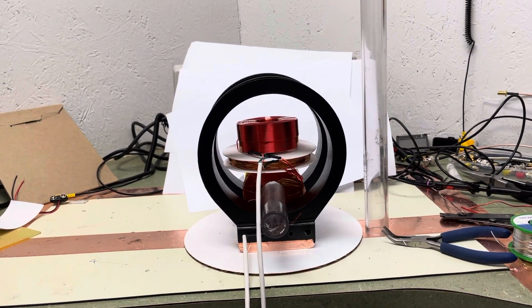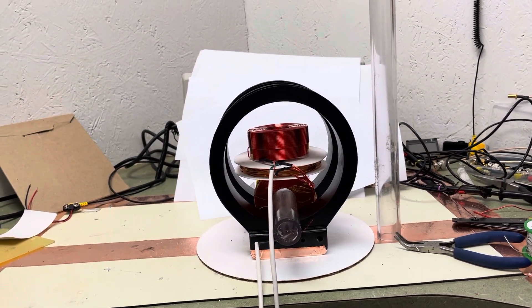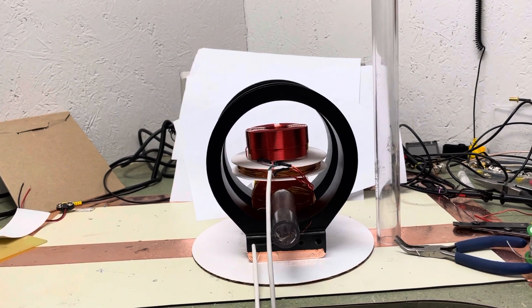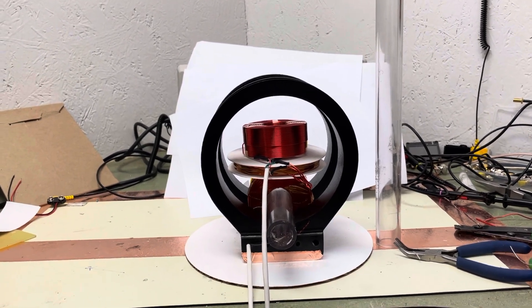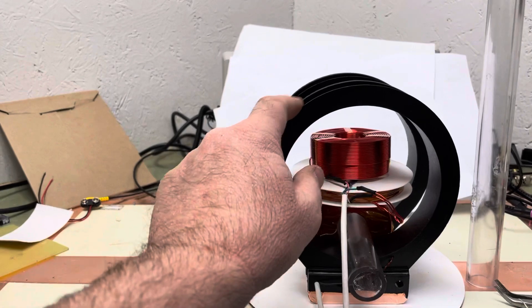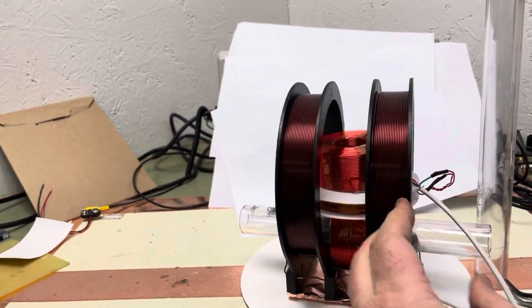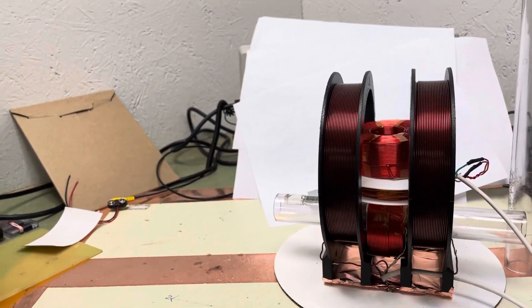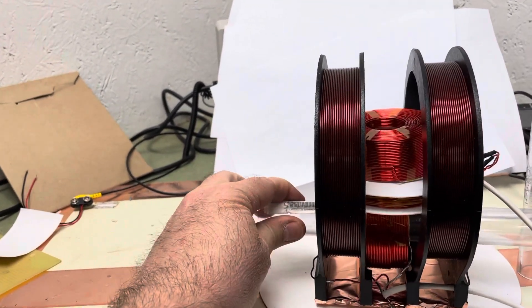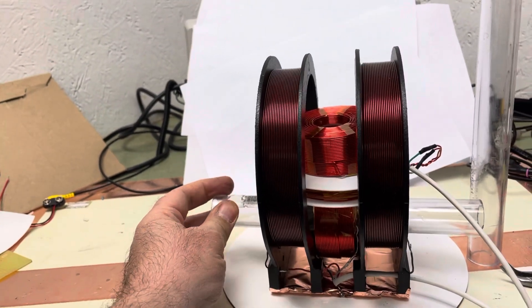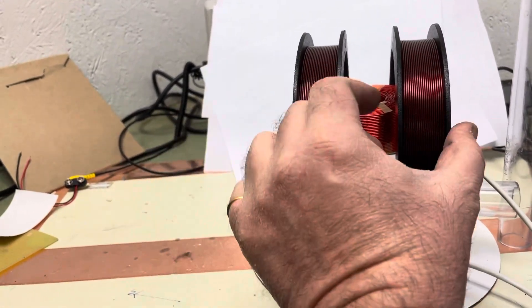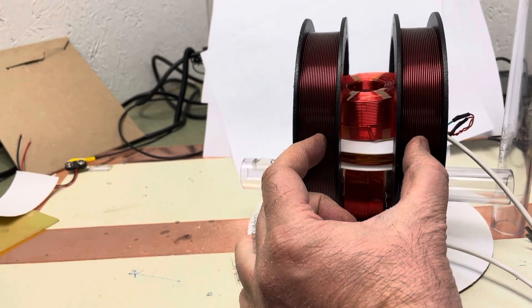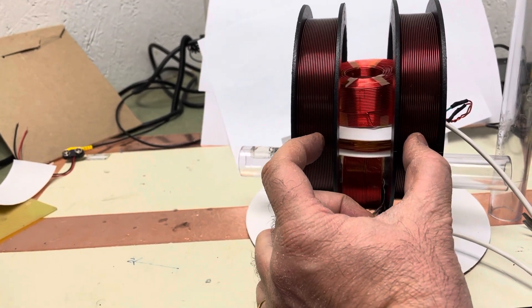So this is my NMR coil setup. I have the Helmholtz coils as you can see here, and then this cross tube is epoxied in place to keep the Helmholtz coils at the right separation. They're five inch coils, so we want two and a half inches center to center.